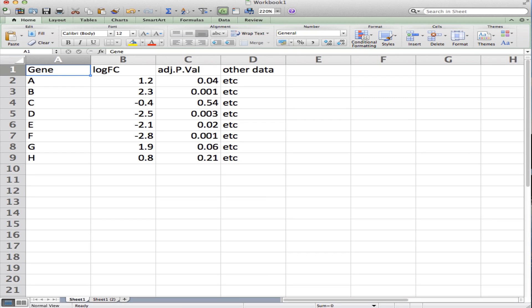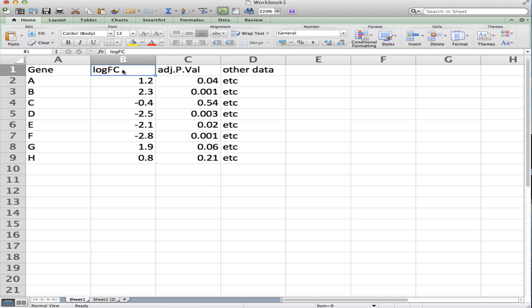In this video I'm going to show you how to filter and sort an Excel spreadsheet with gene expression results. In your gene expression results you'll have a few columns: a gene name, maybe some other identifying information about a gene, the fold change, a p-value—in this case it's the false discovery rate adjusted p-value—and then some other data about that gene.